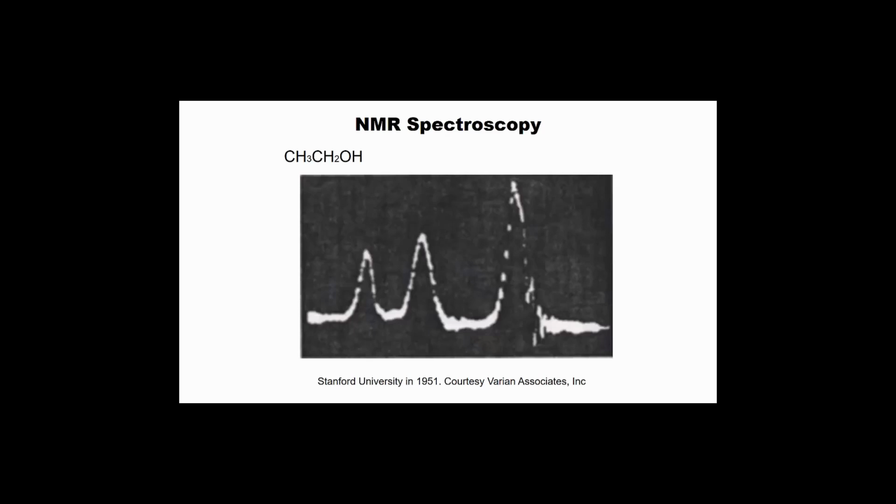This is one of the earliest proton NMR spectra obtained for organic molecules. The molecule is ethanol, and this spectrum was taken in 1951. Looks like quite poor quality, isn't it? But this was the scientific turning point to show the possibility of distinguishing different hydrogen atoms in spectroscopy. This ethanol NMR shows the different environment around each different hydrogen nucleus.